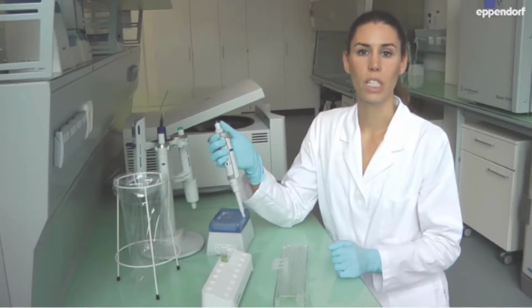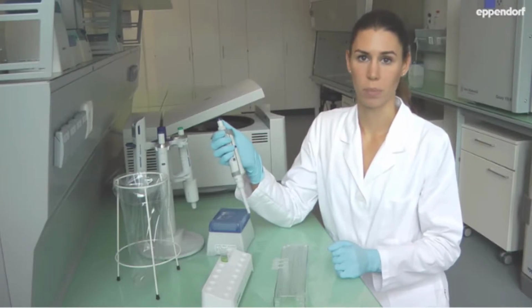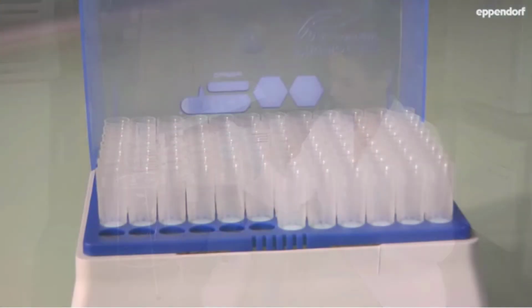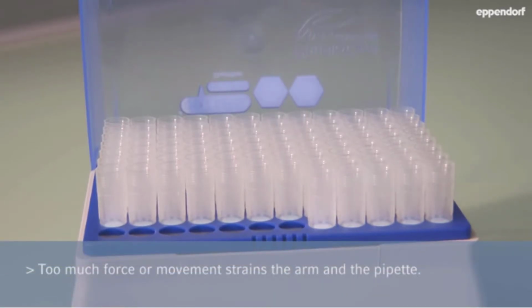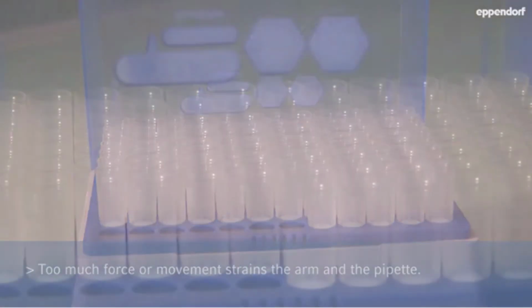Pipetting starts when you attach the tip. Apply light pressure to insert the pipette into the tip. There is no need for force or moving from side to side. This would only strain your arm and damage the pipette.